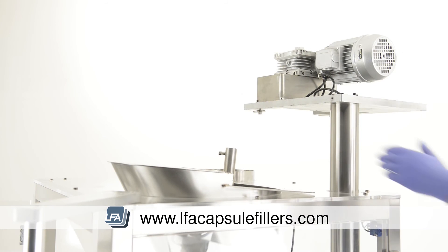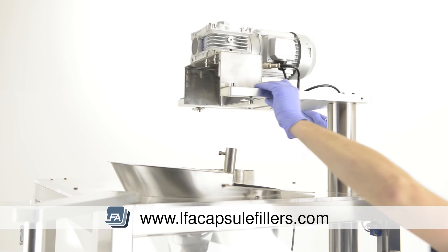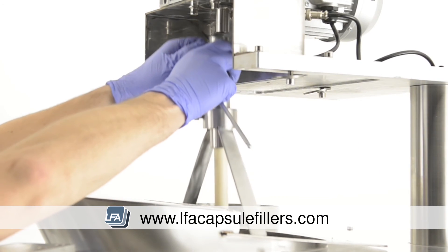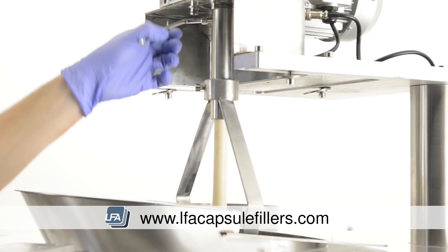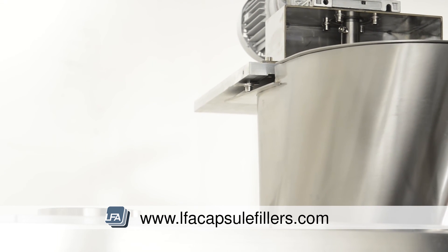Now move the auger filler motor back over the top of the hopper. Lift the auger filler paddle out of the hopper and into position. Tighten the bolt at the top of the auger filler paddle. Raise the hopper into position and tighten the bolts to hold it into place.